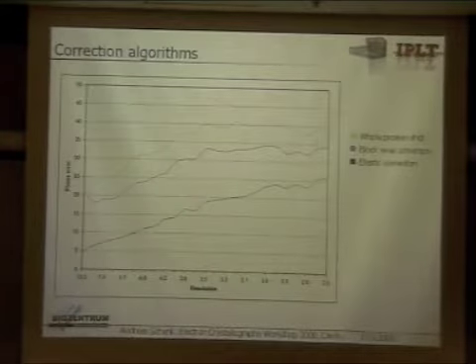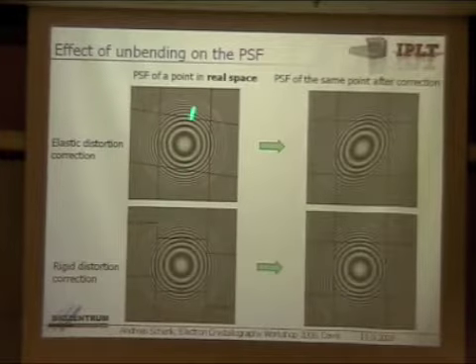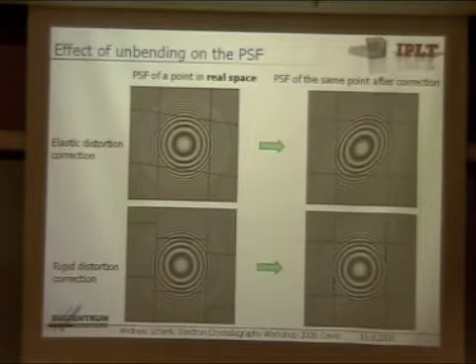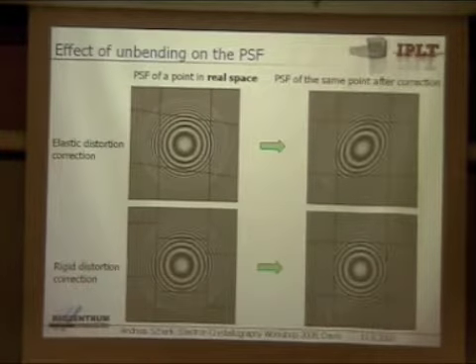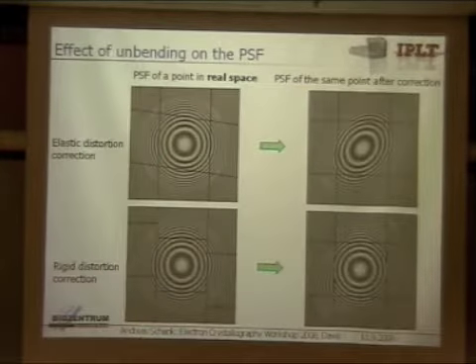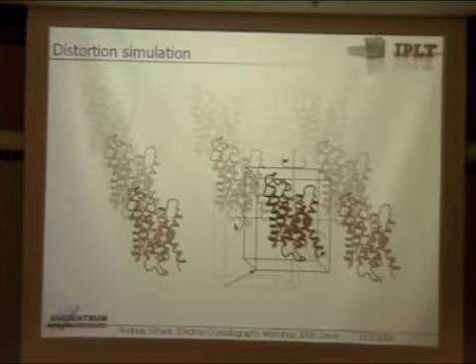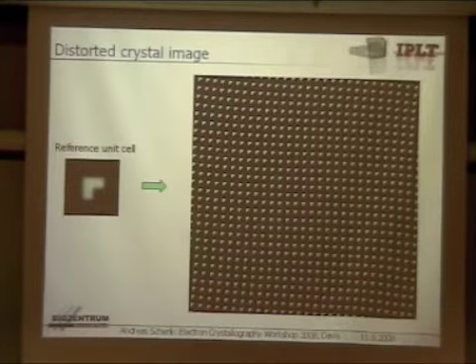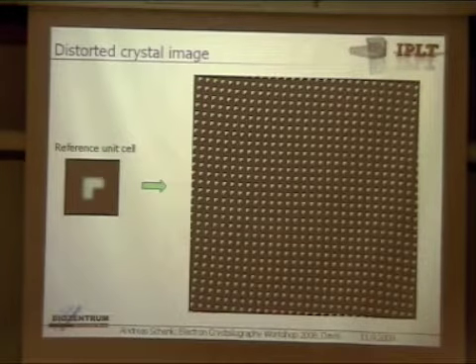Even here, this is the point spread function at 8,000 angstroms defocus, with a slightly smaller unit cell, and it extends quite far. So even in the simulated case, the point spread function will extend beyond the unit cell. Not that much, but if you have a more packed unit cell, the effect will probably be worse.